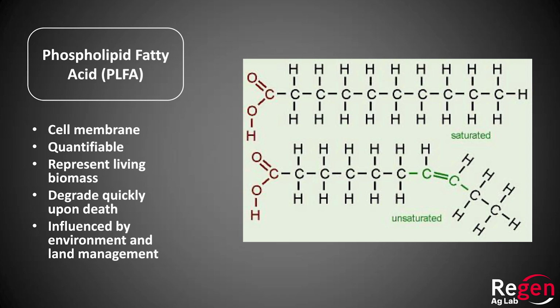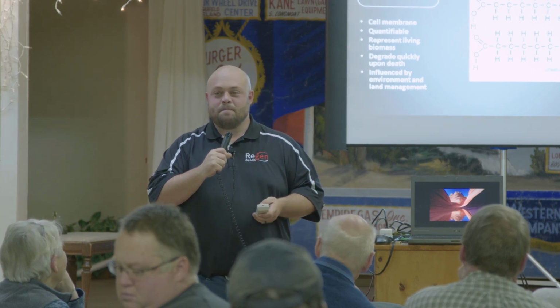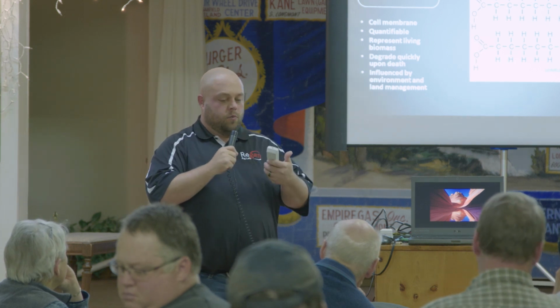PLFA is a wonderful tool because every living organism is made up of cells, and those cells are covered in membranes. That cell membrane, we're going to use that to our advantage. Soil does not naturally have membranes, and it does not naturally produce fat. Short part of this story is that when we run PLFA, we're extracting fat out of your soil. We want to know how fat that soil is. And I'm happy to say the fatter the healthier. I guarantee it.